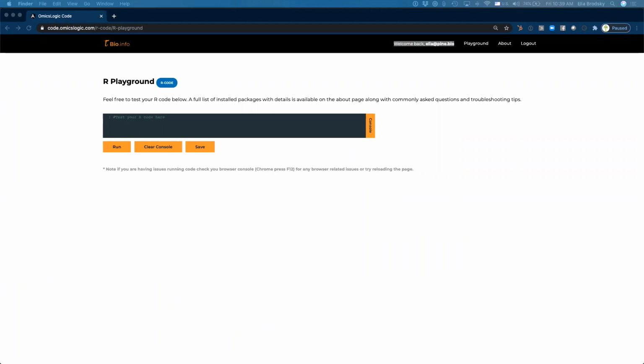All right, excellent. So I think we have quite a few people. Okay, so what we'll do is go to Playground, right? So go to Playground, and we're going to do just a little bit of coding here just to quickly see what's in our table.